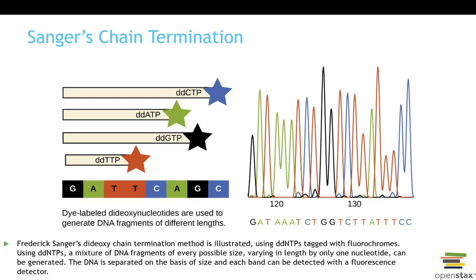So I'm not going to give you too many details about how these techniques of sequencing work, but I want you to have some ideas about some of these techniques. Sanger is one of the oldest techniques that we have in sequencing. It's a very accurate and precise technique, and they still use it especially for bigger fragments.